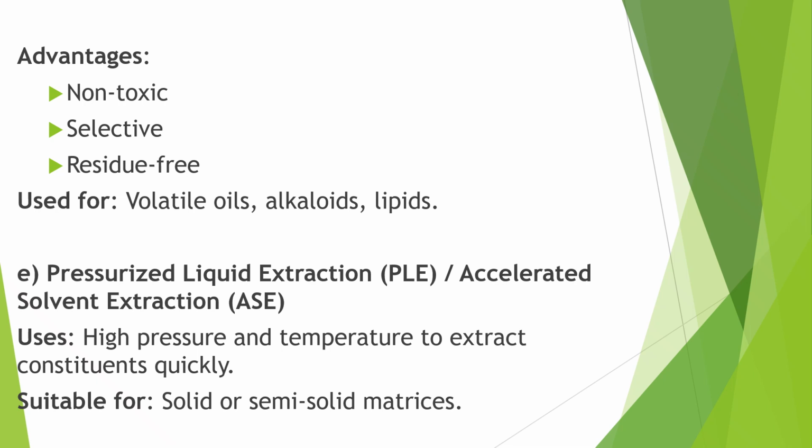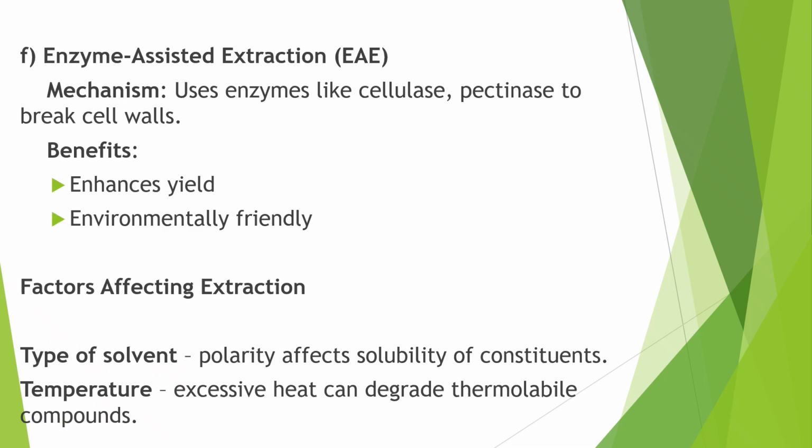Next, moving towards PLE, that is pressurized liquid extraction, or accelerated solvent extraction, or ASE process, where high pressure and temperature are used to extract constituents quickly, and it is very much suitable for solid or semi-solid matrices.